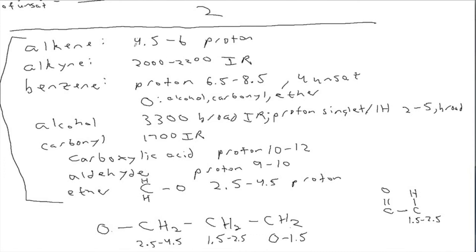So this is stuff that we talked about at the beginning today. Remember we said alkenes are detected from the proton NMR at 4.5 to 6. And we said alkynes are around 2000 to 2200. Your table is a little bit more precise than that. I should have done a better job here. Instead of just saying, I left out nitrogens because nitrogens oftentimes don't come up very much. But anyway, I should have just said here triple bonds. Or maybe I'll say alkynes or nitriles, triple bonds. Alkynes or nitriles. I think this is a pretty reliable absorption.